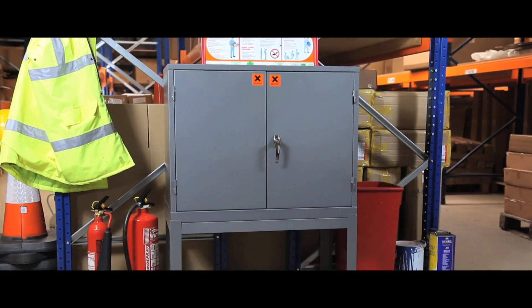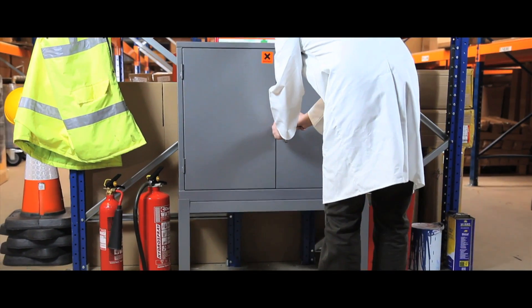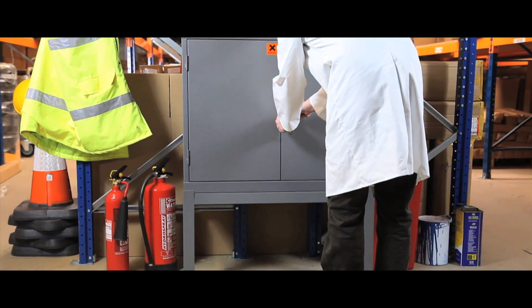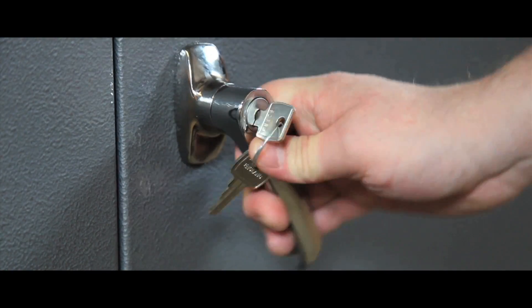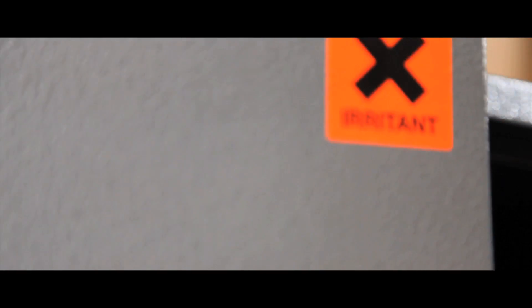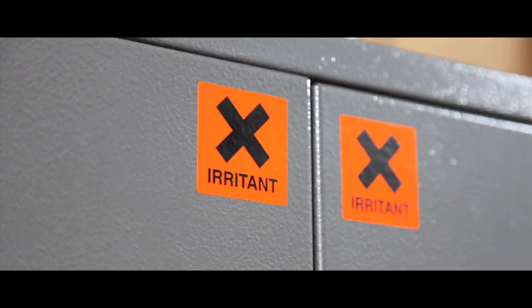Specifically designed to store hazardous substances, these cabinets, supplied in a grey hammer finish as standard, have high impact warning labels on every model.